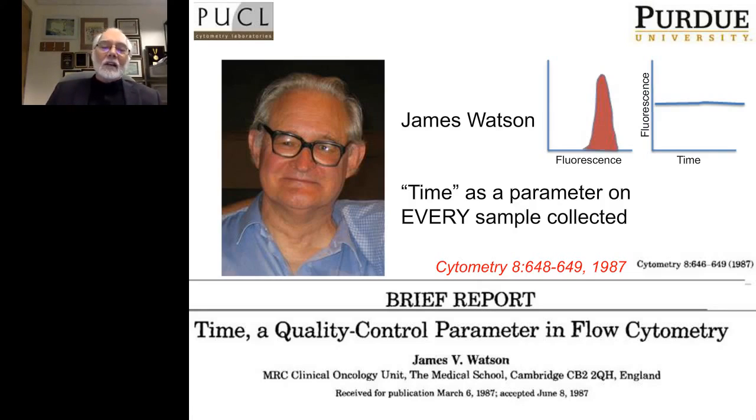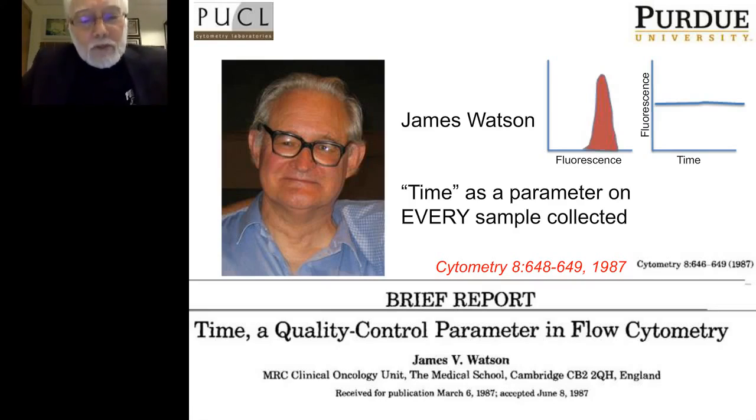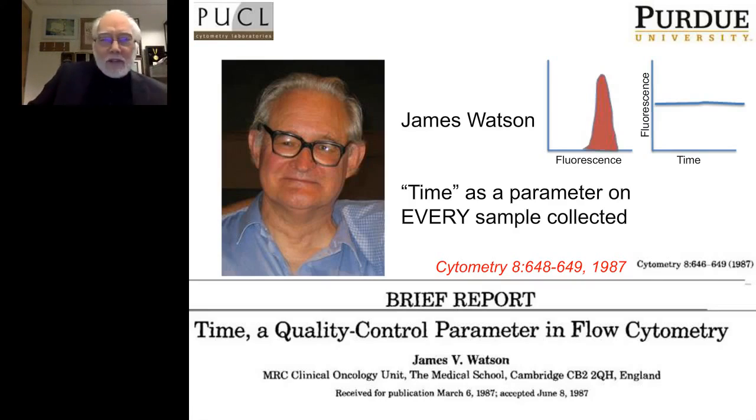And you would see this on a histogram, but if you collect sample for a long time, let's say it takes you a long time to run samples. We're running some samples at the moment where we have to collect a very large number of beads. Well, it's not a huge number, it's 20,000 beads, but in a very dilute sample, and the sample cannot, for a number of reasons, be concentrated.